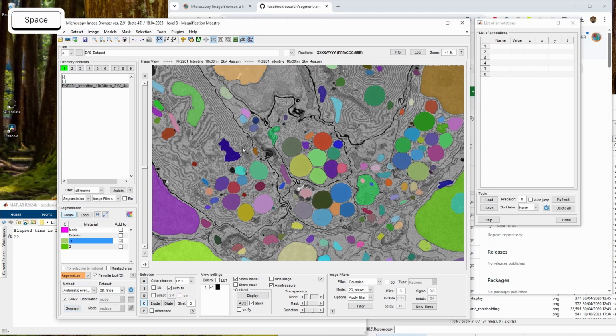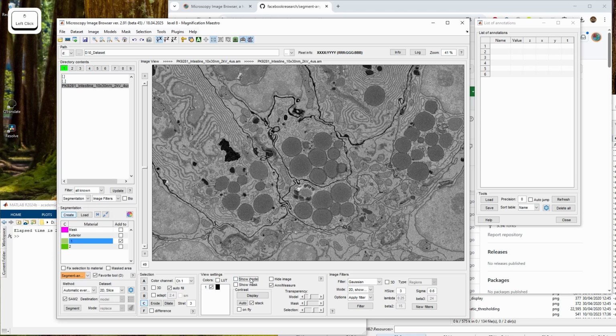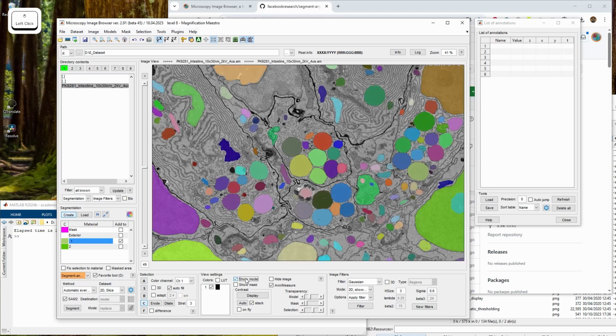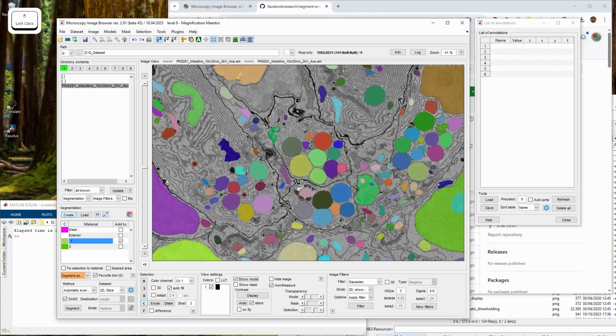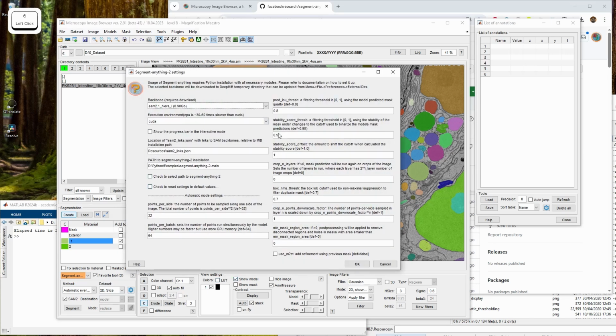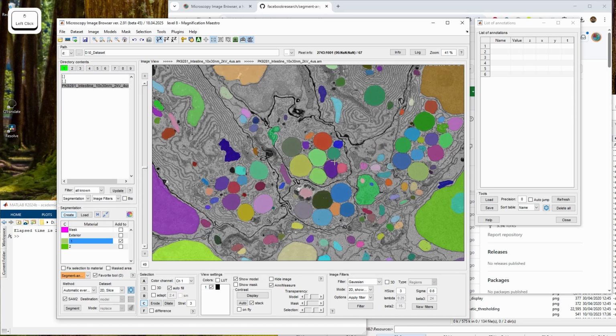Let me toggle the view. I can't toggle this. Oh yeah, so you see, I remember there was a bit of delay on things. So it gives you something, but I don't think that this something is super useful. It's actually possible to fine-tune things a little bit with these parameters, but I haven't played that much with those.